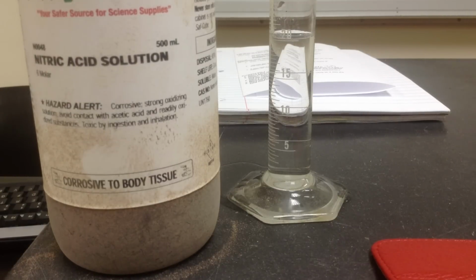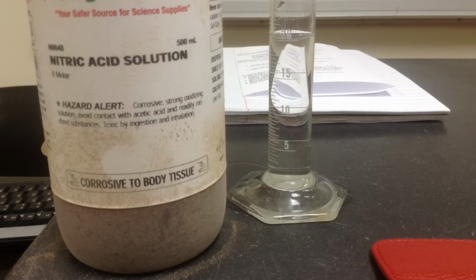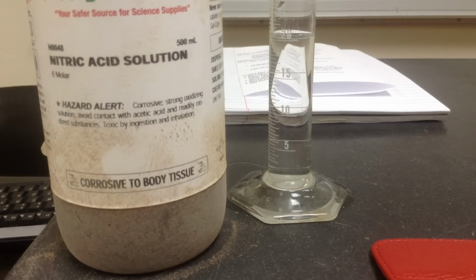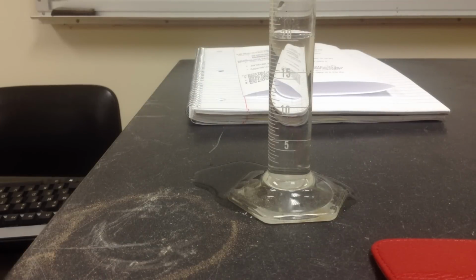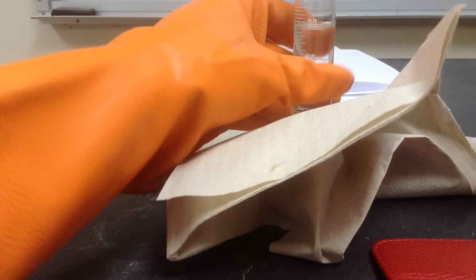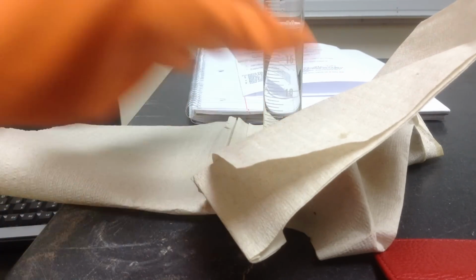We're going to cap that nitric acid bottle and grab some paper towels. It says to add this to a 400 milliliter beaker.